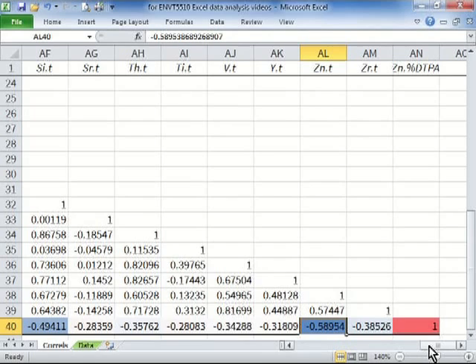If the mechanism for zinc retention in the soil is mainly by some sort of adsorption, a surface process, then usually the more zinc we have in the soil, the more available or mobile it becomes, more extractable by something like DTPA, because with large amounts of zinc we have all the very strong adsorption sites occupied, and so the ones left over for the rest of the zinc will be weaker.